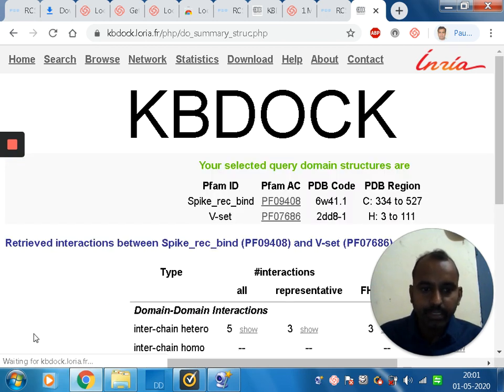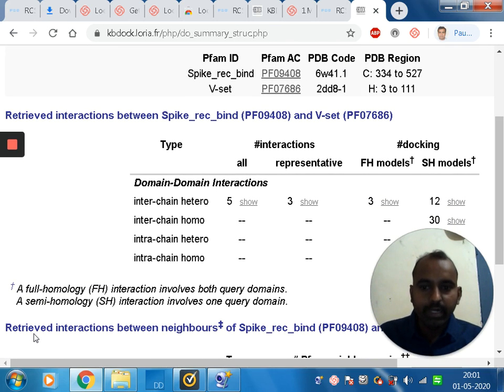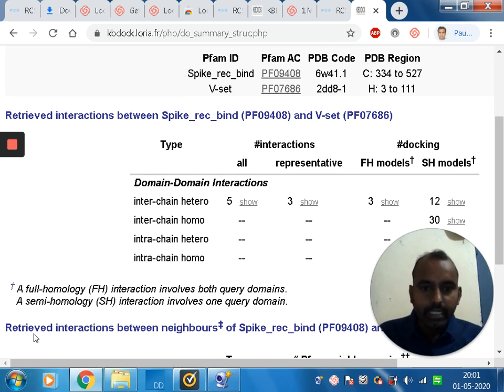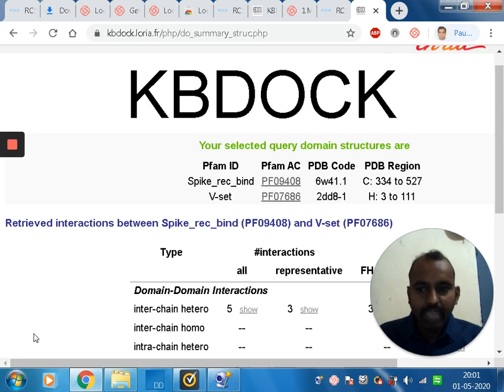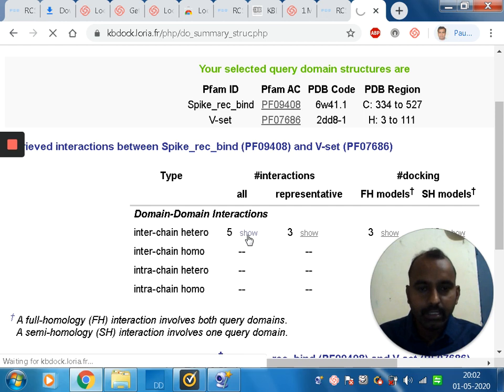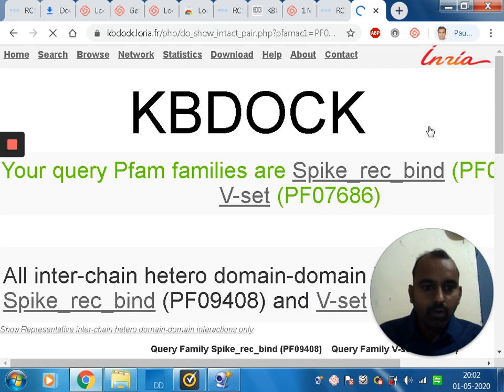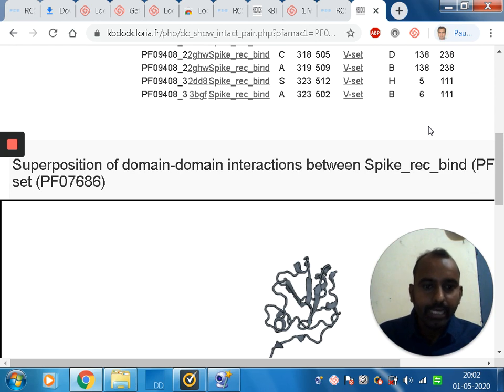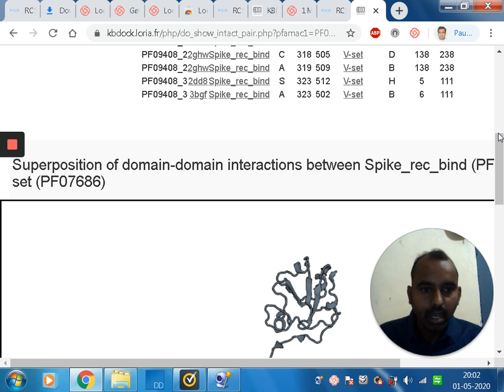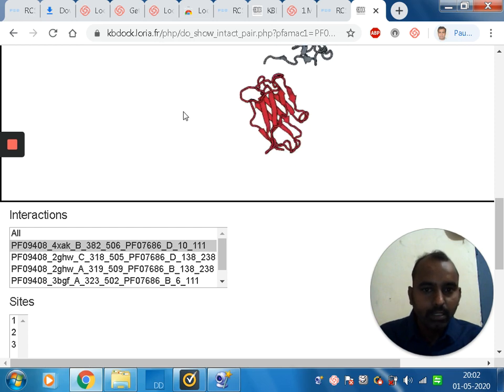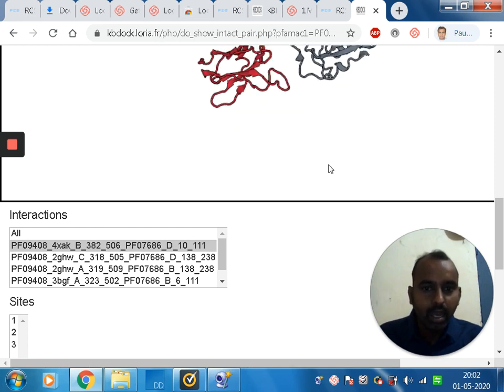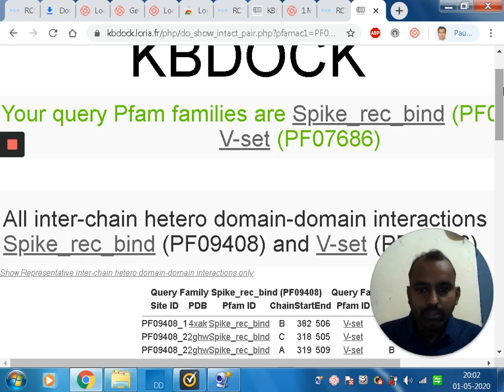Once I click Find Templates, the results show interactions between the proteins. This means it is a probable vaccine candidate — the protein of interest shows interaction. The web server also displays how the superposition of domain-domain interactions between the spike protein and the receptor complex appears. This is the binding domain of the proteins of interest.